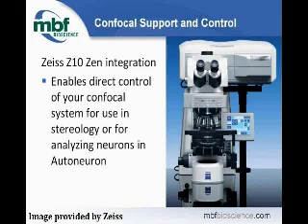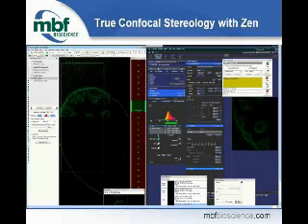In addition, we will manage the registration between the imaging modalities. An example is you might acquire a low mag region of interest with a camera that we control or one that Zen controls. We'll put the image stacks that you acquire later at higher magnification into the right coordinate space. We'll even handle different sizes and deviations in parcentricity.